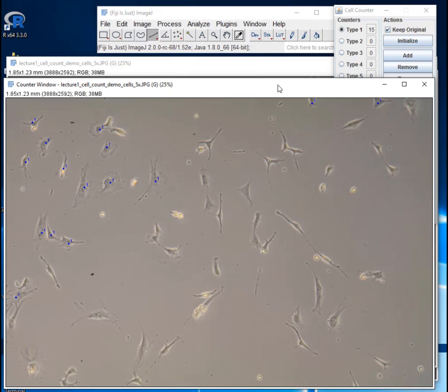This is Dr. Dan again. In the last video I showed you how to count cells using ImageJ. This video I'm just going to show you a couple advanced topics related to that.